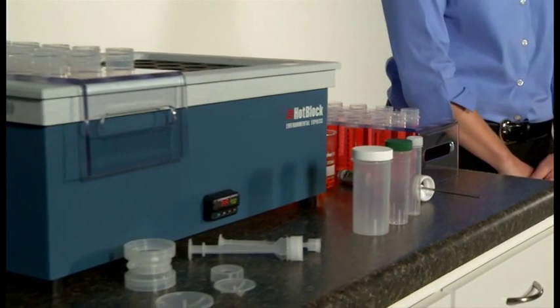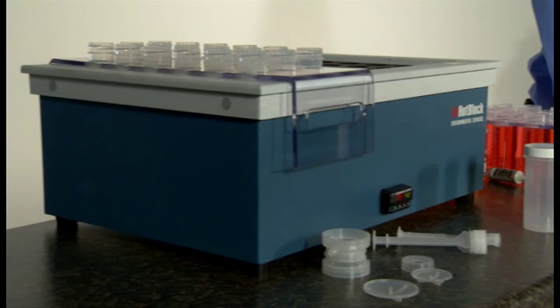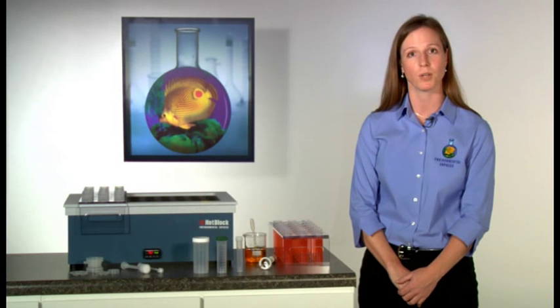The Environmental Express hot block has revolutionized the way metals are digested. It provides uniform heating for samples in a corrosion-free environment.